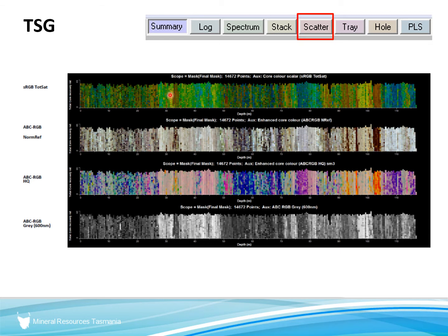As we go from this browny orangey color to a greeny bluey color, in drill core it may look all pretty much grey, but if you stand there with this log in front of you, you can see that slight variation and get your eye in and then pick it off all the way down the drill core. So it's a great training thing for seeing subtle color variations in drill core, and subtle color variations are mineralogical variations.